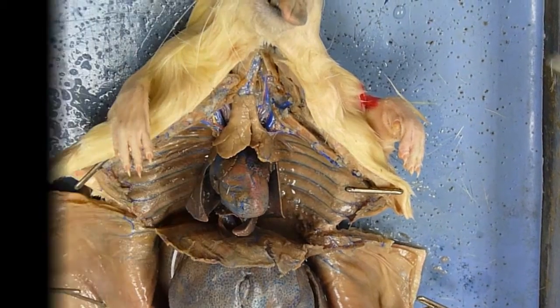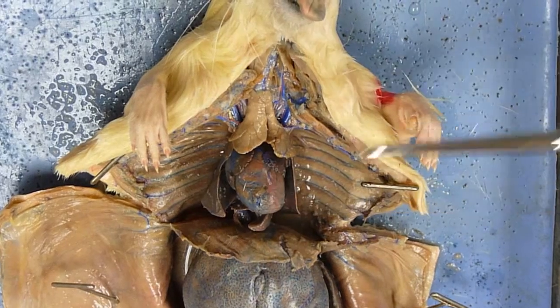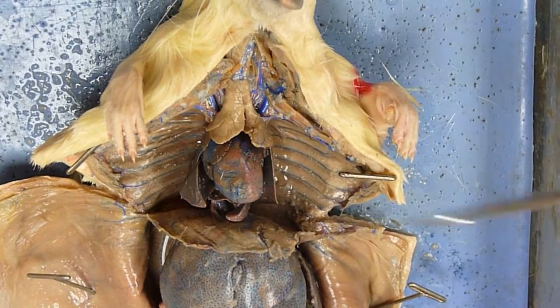Okay, let's start with the thoracic cavity here. First thing we notice, of course, is this big heart. Then we have all these lobes of the lungs here.